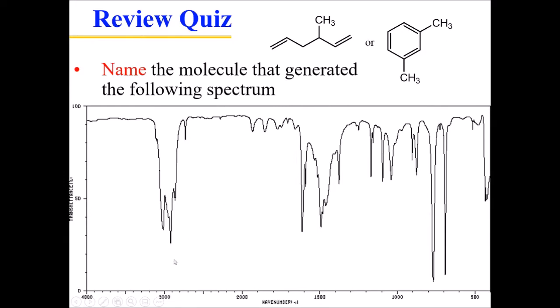So as I'm approaching this IR spectrum, I'm starting at the left, working my way to the right, and I'm trying to identify what functional group would produce each of the major peaks that I'm seeing. This right here is not a major peak. It's a very minor peak. So I'm going to ignore that. These right here are also minor peaks. They really don't tend to be even half as tall as most of the peaks in the spectrum.